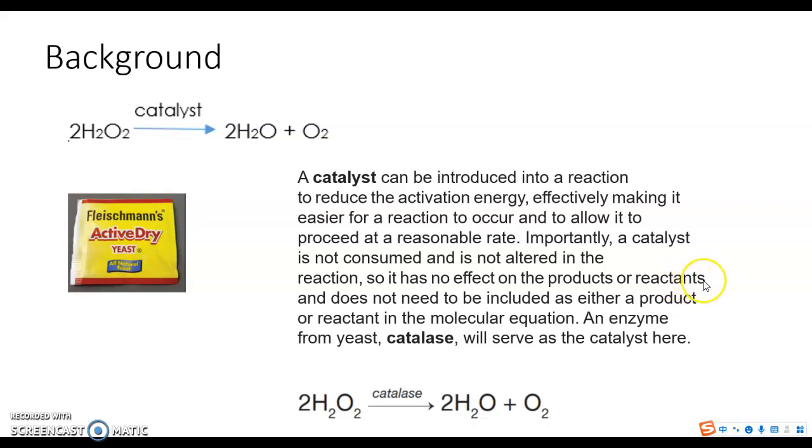More catalyst won't give you more product. A smaller amount of the catalyst won't lead to a lower yield. As long as you don't pour a large quantity of the catalyst or just a super tiny little bit of the catalyst, a reasonable amount of the catalyst will work, but you don't need to be very exact.